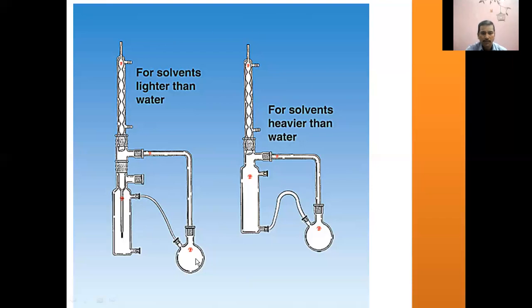So organic solvent without analyte has been used to perform the extraction. Then once the continuous extraction process is completed, solutes have been transferred into the organic solvent. So this type of provision, while making outlet at the upside, is to collect the organic solvent which is lighter than water. This is vice versa because the organic solvent is heavier than water. So same thing, organic solvent will be evaporated in order to convert that into vapor, and the vapors will be condensed back into liquids, and the liquids will pass through the aqueous sample solution which is present in this tube.